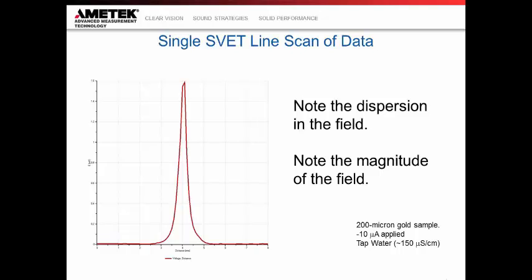So when we start looking at resolutions, a single pit in a small background, if it's intense enough, we'll be able to measure it. But this also will tell you, if you have two pits that are very, very close together, the precautions that you need to take so that you don't visualize those as a single event.